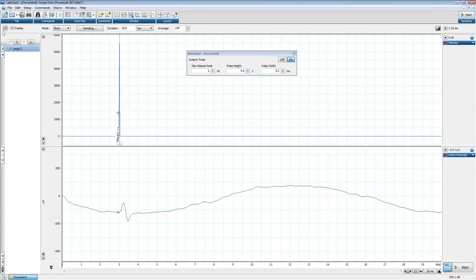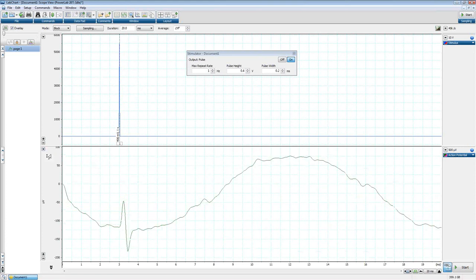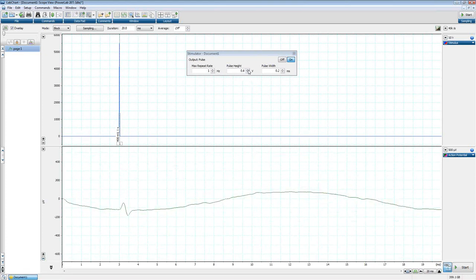we'll see our stimulus marker here. This time it's shown on the top channel. Here's our stimulus artifact. On our recording channel, remember when we're using LabChart, the bioamplifiers will always show up on channels 3 and 4. We've actually hidden channel 1 here. It's compressed up against the top of the screen, and we're using channel 2 as our stimulus marker here. So just a little bit different than what we saw in LabTutor. I can go ahead and I can auto scale that. You'll see there's our same 60 cycle noise. Now we'll increase this a little bit and see if we can find threshold again.